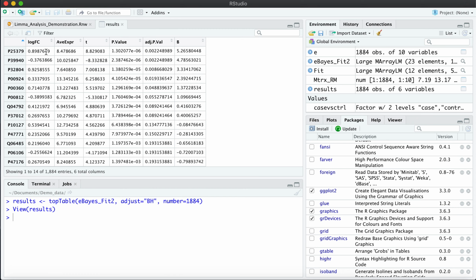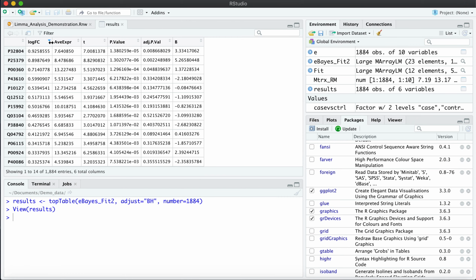So this result we can already sort by expression. Let's say that I want to see the most upregulated proteins. Most of the time, the log fold change cutoff can be an arbitrary approach. So we can check in here that we can have a cutoff of some significance at a log fold change of 0.58, which is the same as a fold change of 1.5. At least we have 4 proteins that are above or equal to 1.5 for logarithmic fold change and are significant, but of the 4 of them, 3 are true positives that are significant in this analysis.